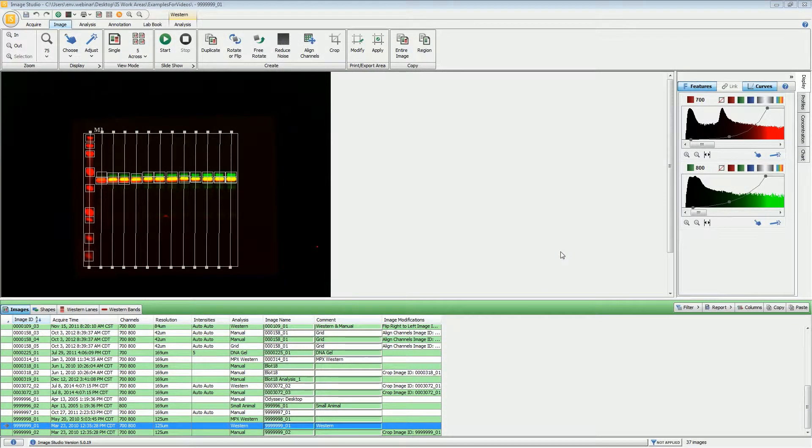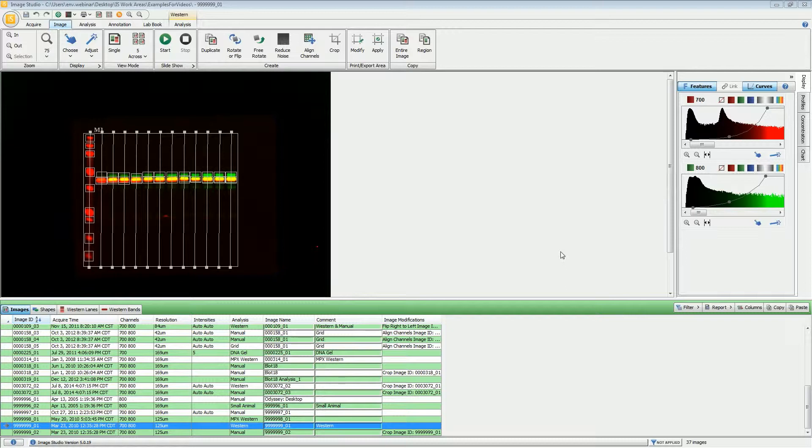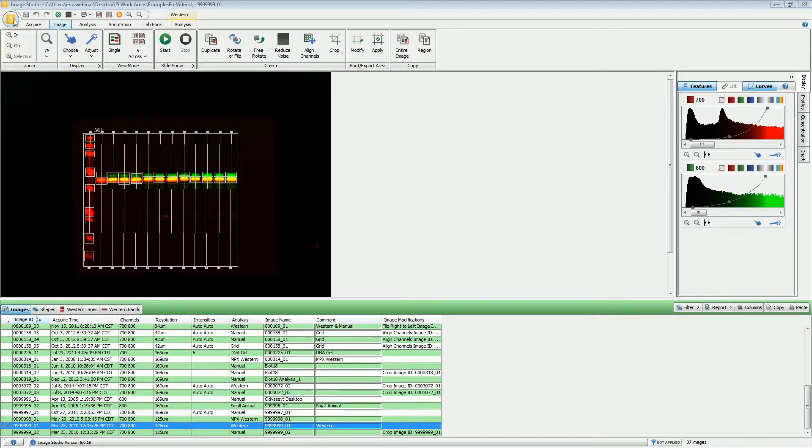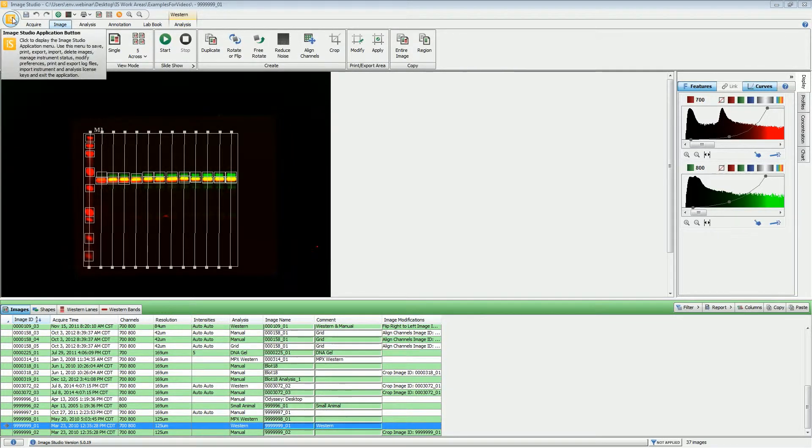In this video, we'll be discussing your options for exporting images from Image Studio. If you want to export the image that you currently have available, the first thing you do is come up to the Image Studio application button in the upper left-hand corner and choose Export.